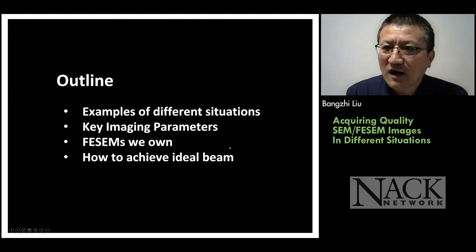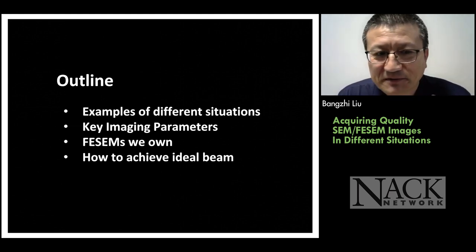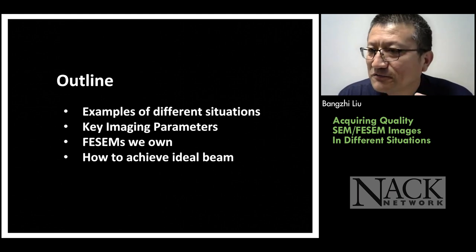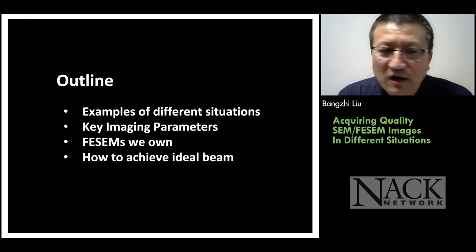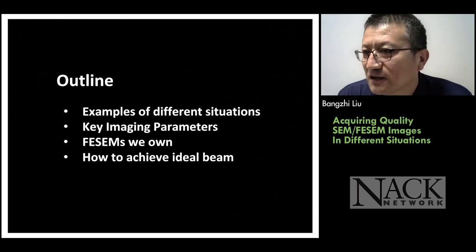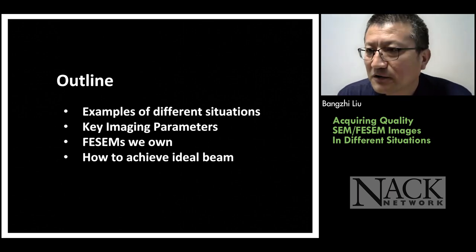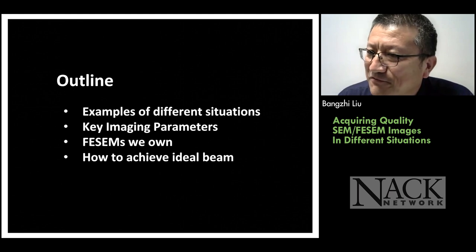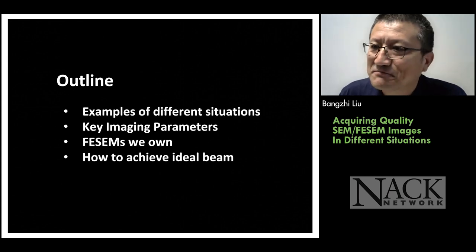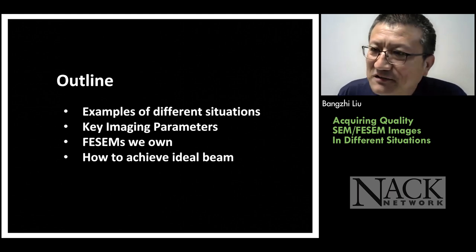So my talk will have four sections. I will give you some examples of different situations for SEM imaging. Then I will talk about the key imaging parameters, then the SEM we own. In the last section, I want to talk about how to achieve an ideal image, making sure the beam is right. That's the outline of my talk. In the end, I hope you can feel the passion I have for SEM, and I hope you can have the same passion if you ever use SEM.